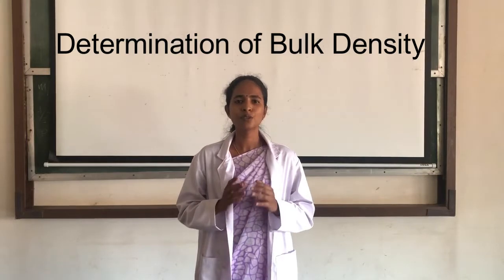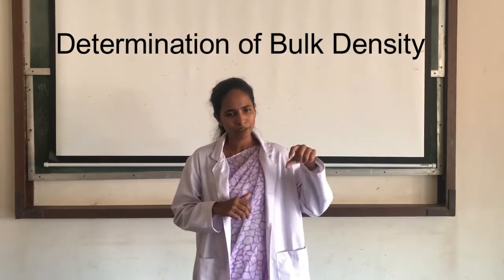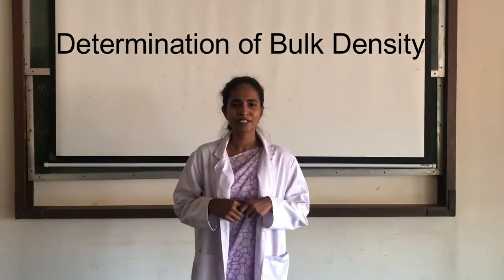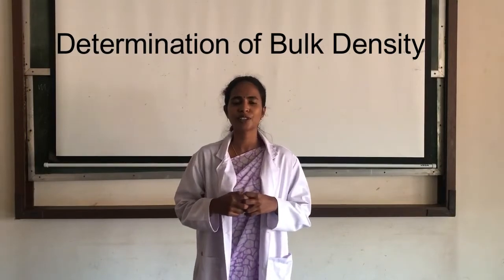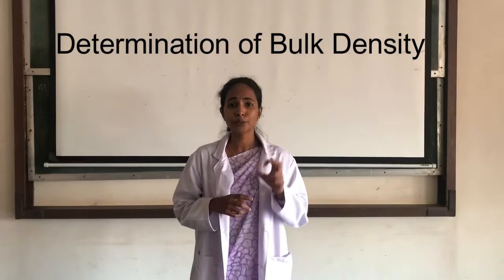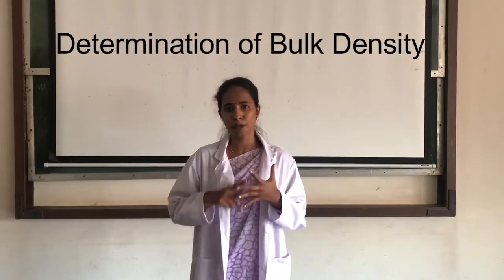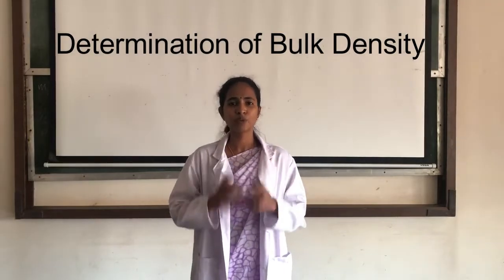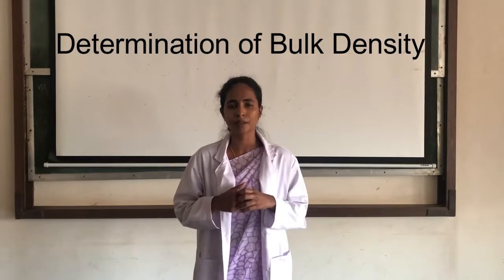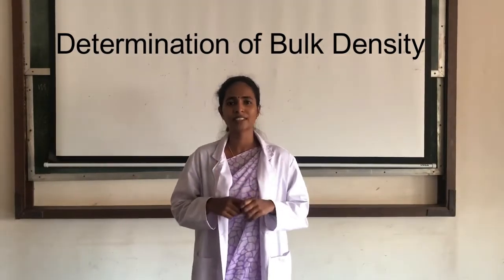The bulk density is usually determined by using the core sample, which is obtained by driving the metal corer into the soil to the desired depth levels. Bulk density is a good index for the structural changes of soil, and also a good indicator of the suitability of the soil for root growth, root penetration, as well as soil permeability. Actually, it is vitally important for the soil, plant, as well as the atmospheric system. Indeed, the bulk density is always less than the true density.